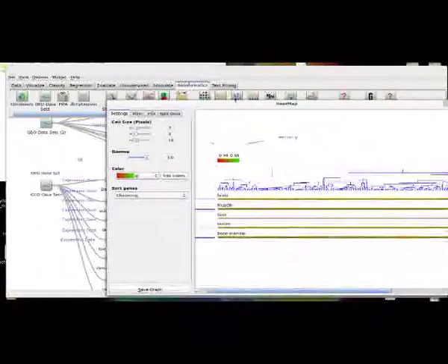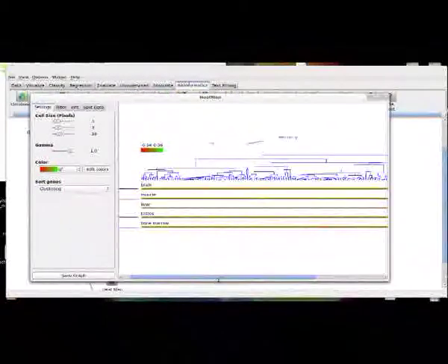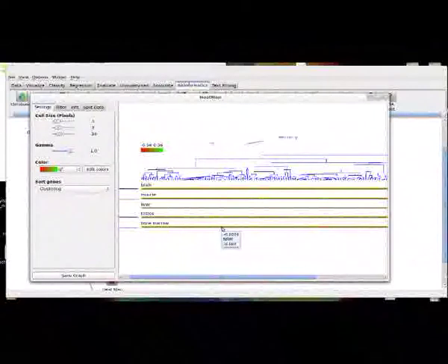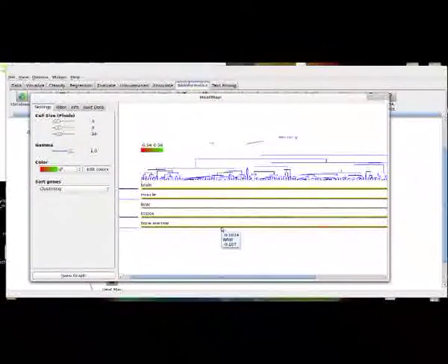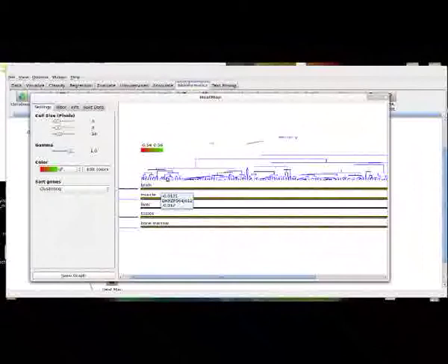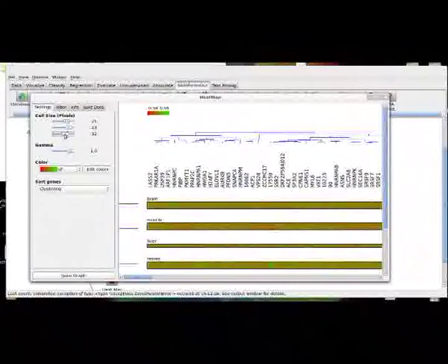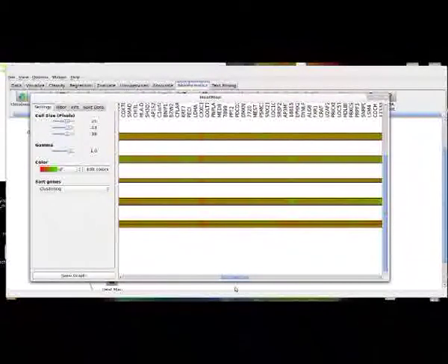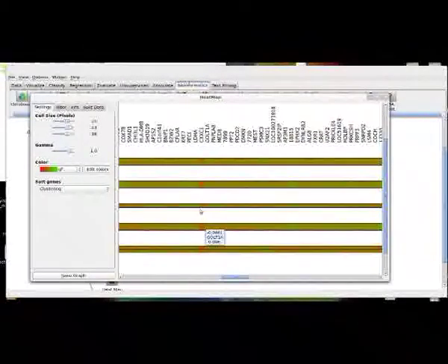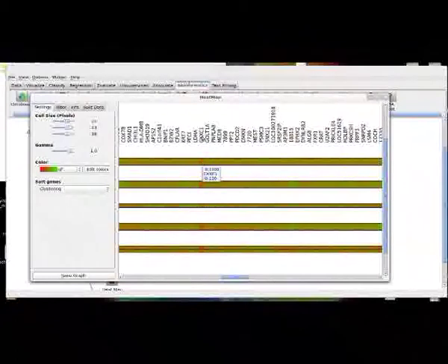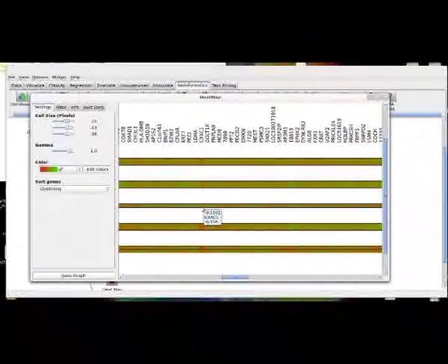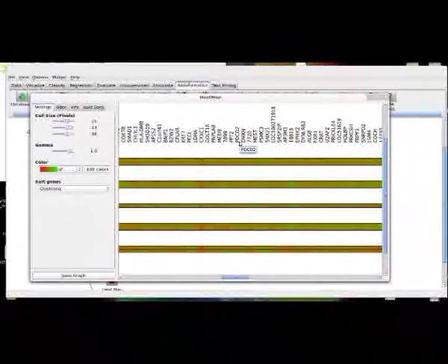So let me make this window a little bigger. The idea here is that you have genes on your y-axis and the color of that point... I do not seem to be able to zoom in. Oh, I can make this bigger. Oh, God, okay. Let's make this a little bigger. We can see the gene names. All right, this looks good. So the color here is going to indicate either a high expression or a low expression. So we can look at these, and we can see that all of these tissues seem to have low expression in this one gene, and that gene is CXXC1.